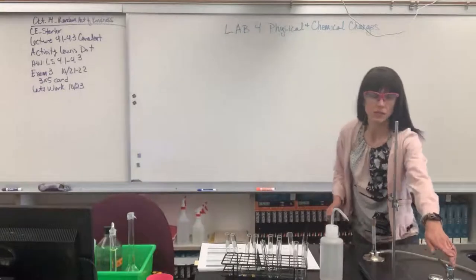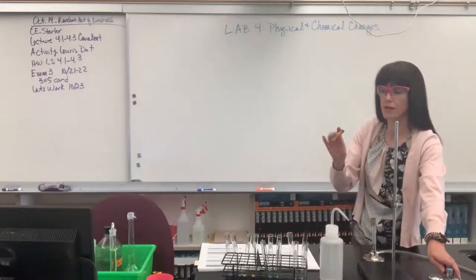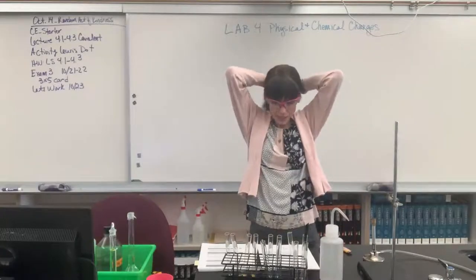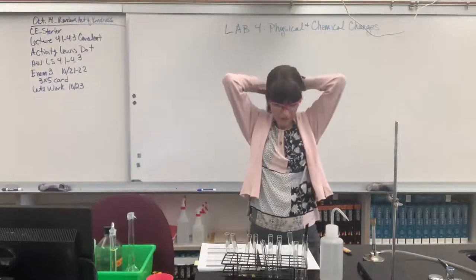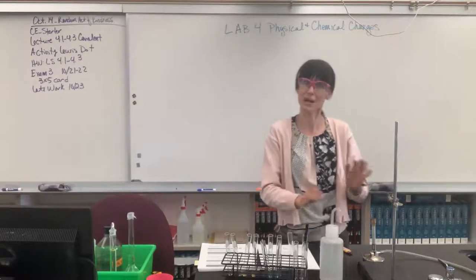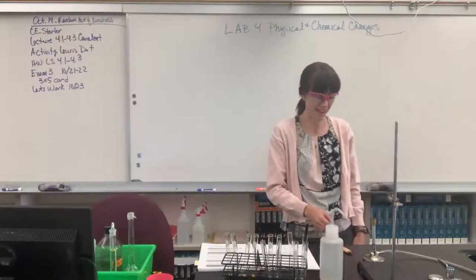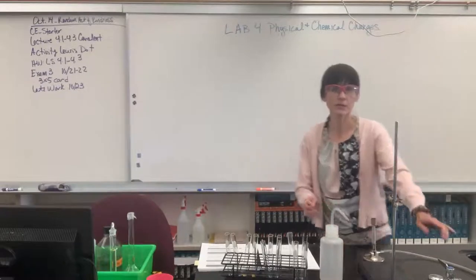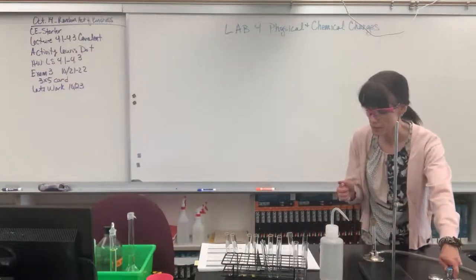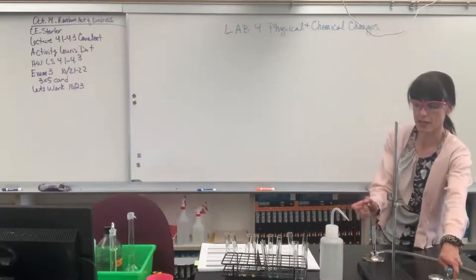What I do is I slowly turn on the gas. Oh, something really important. Whenever you use a burner, make sure that you pull your hair back. You don't want to accidentally lean into the flame and ignite your hair. It would not be good. So good safety, pull your hair back. Okay, so I slowly turn on the gas and I listen for the gas. Okay, I can hear the gas and then I light it.